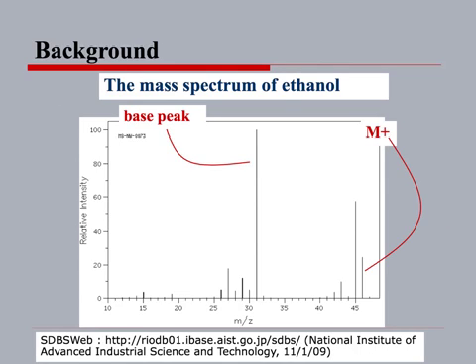Many times it's combined with NMR and some other techniques, but it can also be used individually for that purpose. So this indicates the base peak, and this is the parent ion peak.